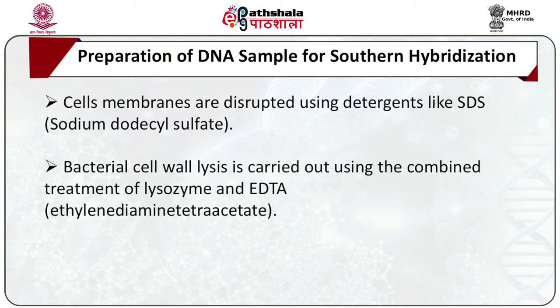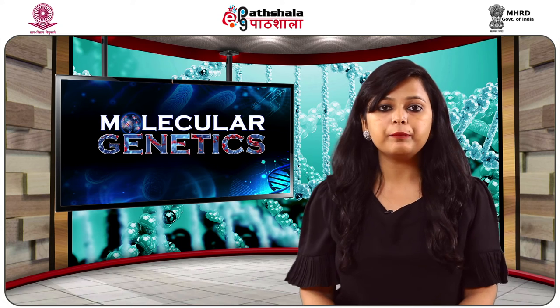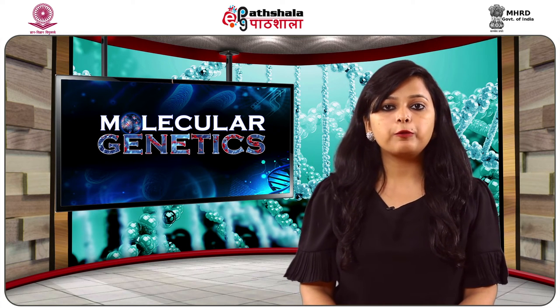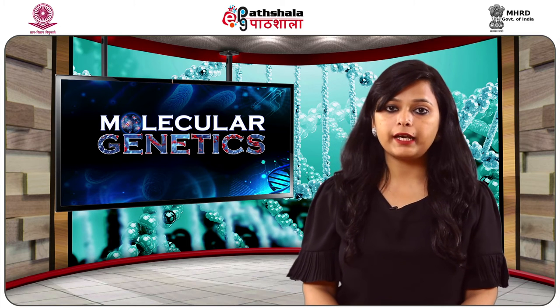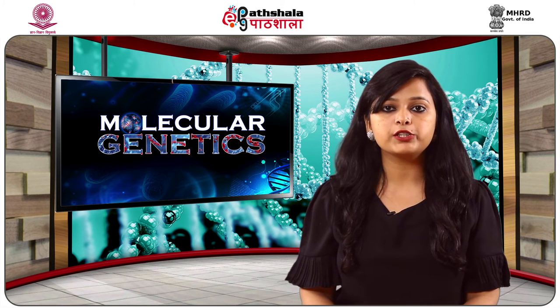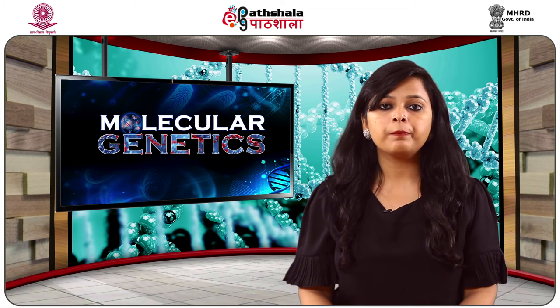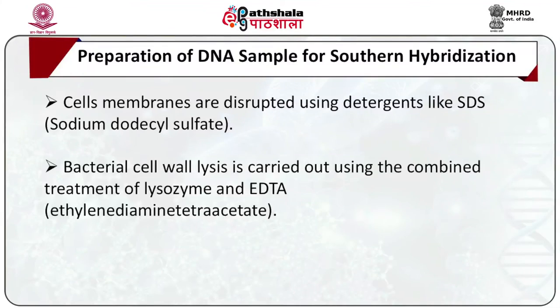Now, let's talk about preparation of DNA samples for Southern hybridization. The DNA preparation method depends on the type of DNA sample required for Southern blotting. In the case of high molecular weight genomic DNA preparation, where random shearing of the DNA has to be prevented, the cell membranes are disrupted using detergents like SDS, that is sodium dodecyl sulfate.